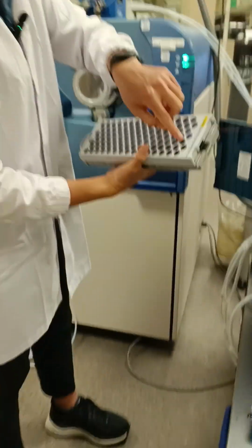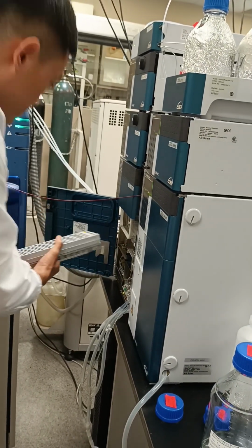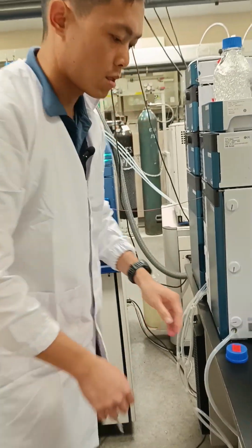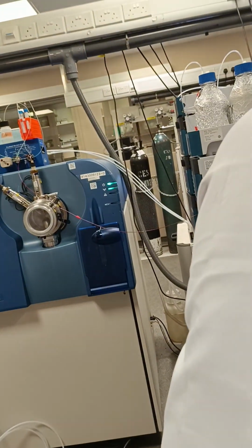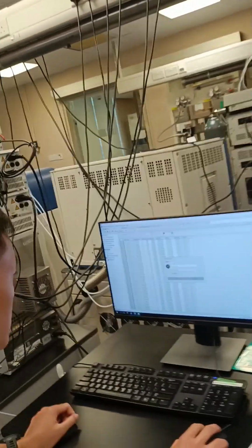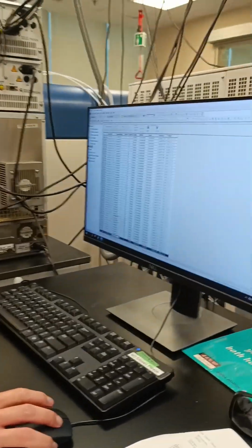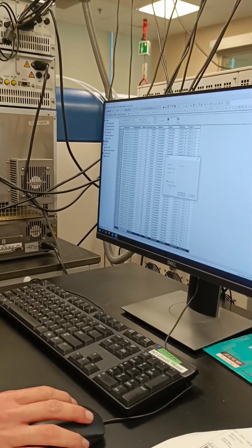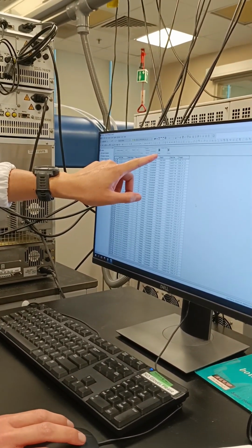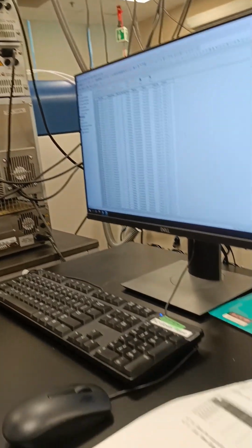So I'll cancel out one sample because I don't have enough QC blank. Okay, so 74 only. Because I only have 74, I will just cancel one from here. Delete samples. Yep, so 1 at 4. Now you get to see this become ready, right? Okay, so that means everything is okay. Then you can just start samples.